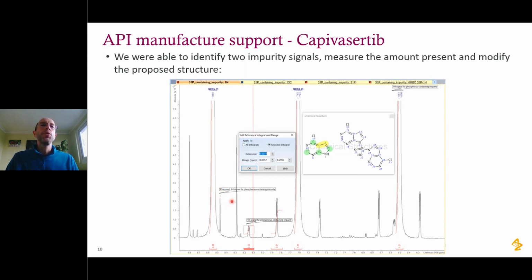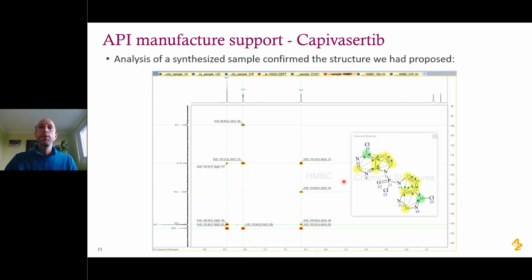And we move on to what is always the ultimate goal with investigations like this, and that is isolation or synthesis of a pure sample of the representative material. The chemist did a really good job with this and provided me with a solid sample, and I was able to dissolve that in DMSO and then, as you can see here, go through the usual process that we go through to establish the structure of a compound, gathering the usual 1D and 2D NMR data, tying it all up nicely together in Spectra's processor to give you a single object that allows you to confirm and verify that structure. You can see I'm showing the HMBC data here as an example. And that's really the last piece of the puzzle.